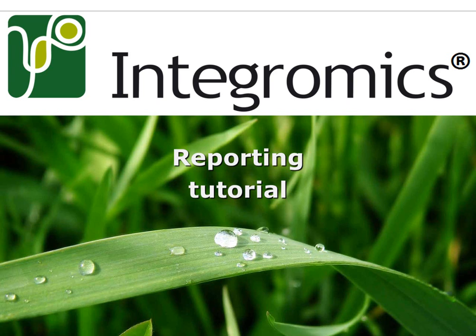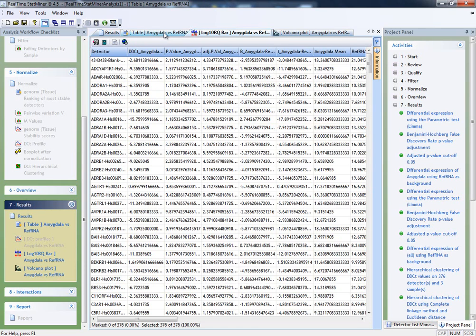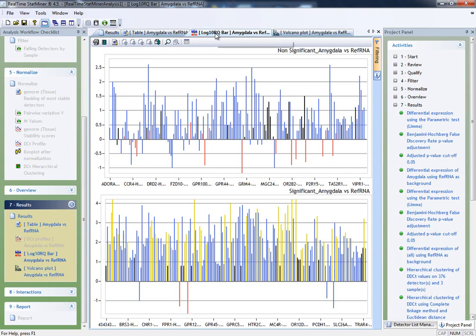This tutorial will introduce you to creating reports that summarize specific results from your analysis that you might want to highlight, publish, or share. This report basically consists of a set of data tables representing any type of data coming from the analysis and of visualizations that helps to summarize and understand this data. These reports can be exported to well-known formats, making it easy to share between co-workers.